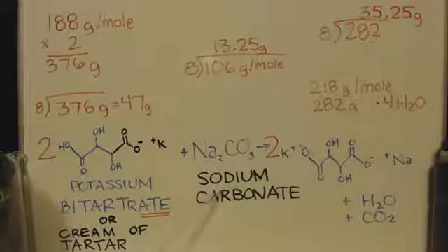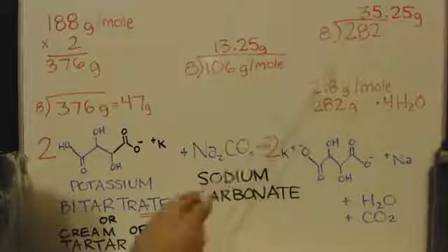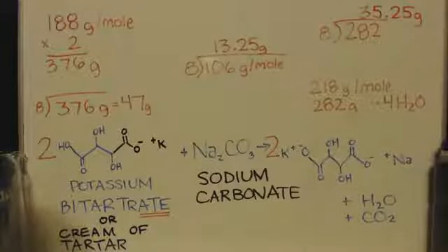What about the sodium carbonate? The sodium carbonate is 106 grams per mole. I divide it by 8 because I only did an eighth of what I was supposed to here. And I get 13.25 grams, and that's what I put in. Now my estimated yield is going to be 218 grams per mole, but this is a tetrahydrate, and we're going to crystallize it out of water. So that means there's going to be 4 water molecules in a tetrahydrate. So that's 282 grams per mole. So up here, we divide that by 8. Our estimated, our theoretical yield is 35.25. But we're going to have to crystallize it and maybe recrystallize it a second time, so we're going to lose some product there. Anyways, I always remember, science is great.